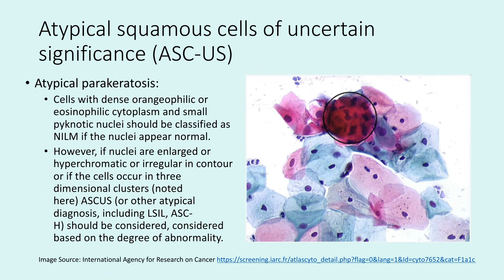Another subcategory is atypical parakeratosis — cells with dense orangophilic or eosinophilic cytoplasm and small pyknotic nuclei. These should be classified as normal if the nuclei appear normal. However, if the nuclei show hyperchromasia, irregular outlines, or appear in three-dimensional clusters, you can call it ASCUS. If changes look like low-grade or high-grade in such areas, you can make those diagnoses instead. Atypical parakeratosis is not in itself a diagnosis, but many of these cases fit into the ASCUS category.